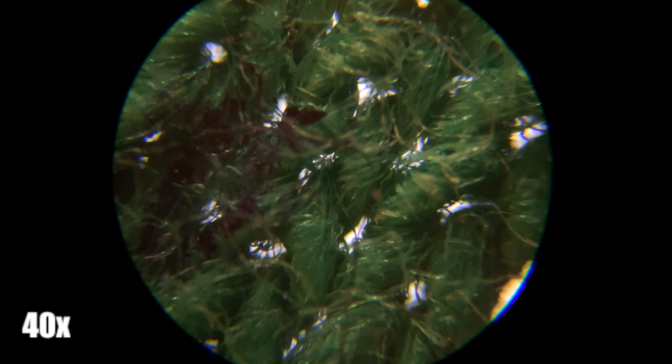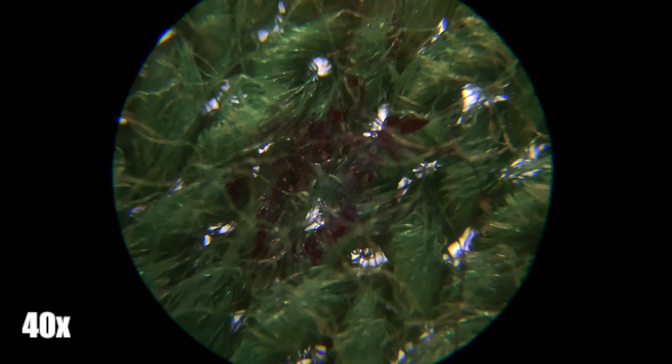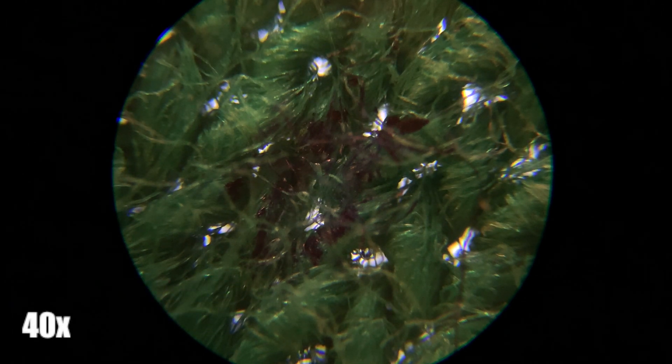Because t-shirts are so popular, it is important to make them out of cheap and readily available material. This t-shirt is made out of 100% cotton, so what you see here are actually cotton fibers woven into a shirt.